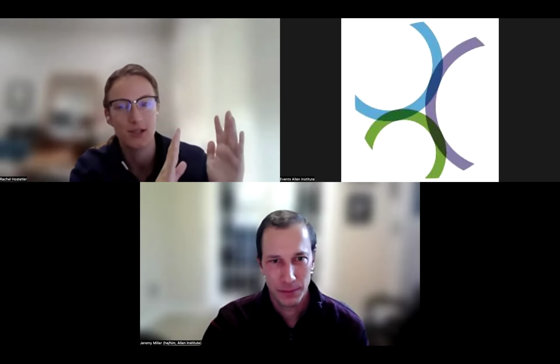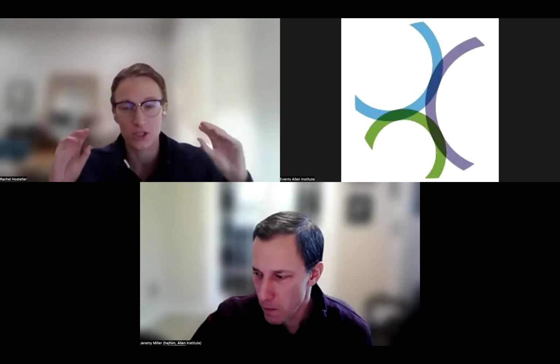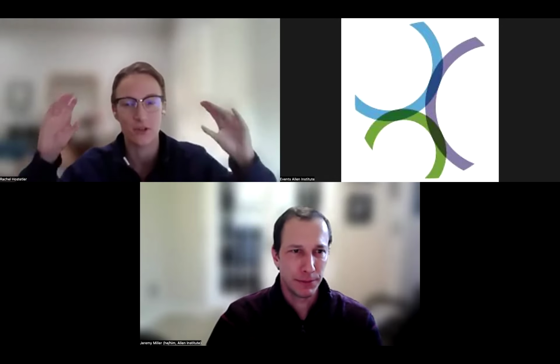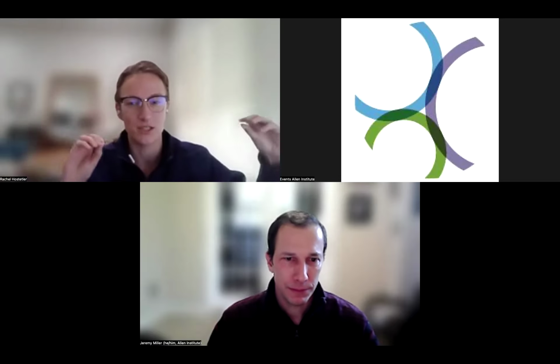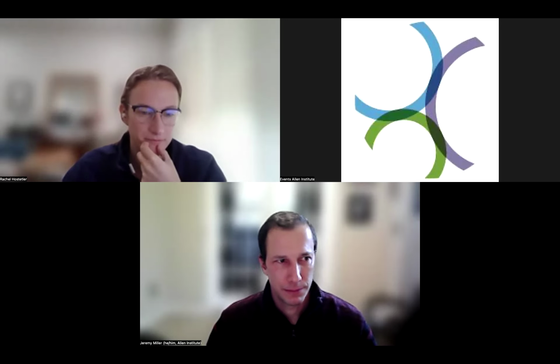Yeah, I personally like using the river plot function to see that, because for me, I think that's another great way to visualize. You have one taxonomy on one hand, the other taxonomy on the other, and depending on which level of the taxonomy you're looking at, if you're looking at the subclass level versus the cluster level, subclass tends to be more consistent, but sometimes those individual clusters then split into other clusters in another taxonomy, and you can see that pretty clearly in the river plot.